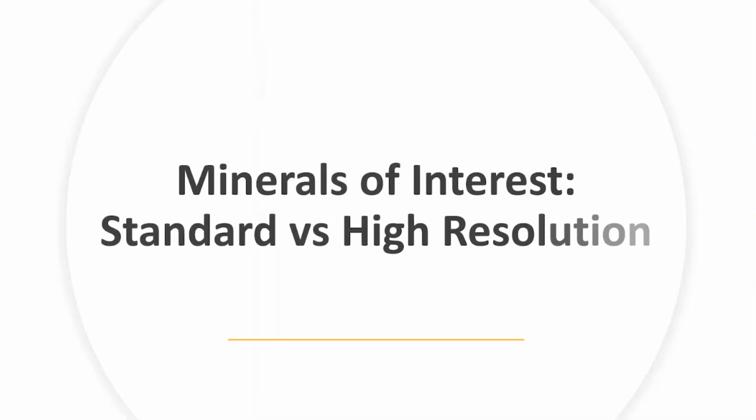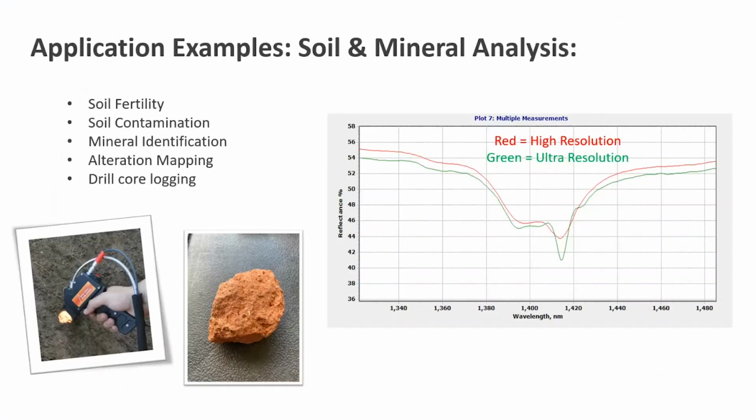So now I'm going to talk about a couple different applications and how it relates to standard versus high resolution. So first I'll talk about soil and mineral analysis. You can analyze soil fertility, soil contamination, mineral identification, alteration mapping, drill core logging. All of this is affected by the resolution of the instrument that you're using.